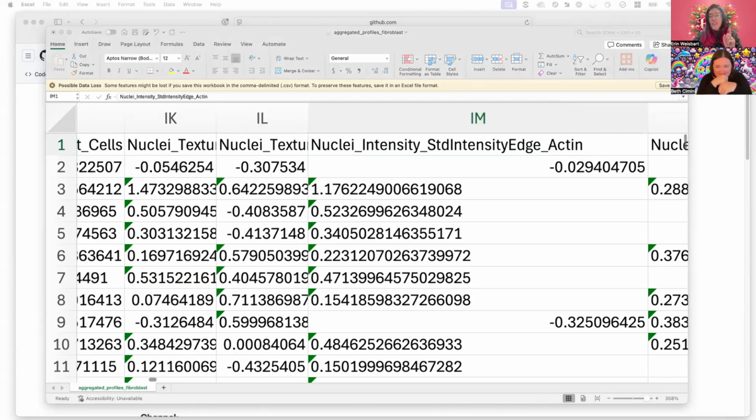And so here, I think this is a really important point that I want to make about CellProfiler features. We will get questions about this, like, okay, but how is that interpretable? You can't interpret actin in the nucleus. There is no actin within the nucleus. Well, a little bit, but it shouldn't be F-actin. It's phalloidin, and we should not see F-actin within the nucleus.